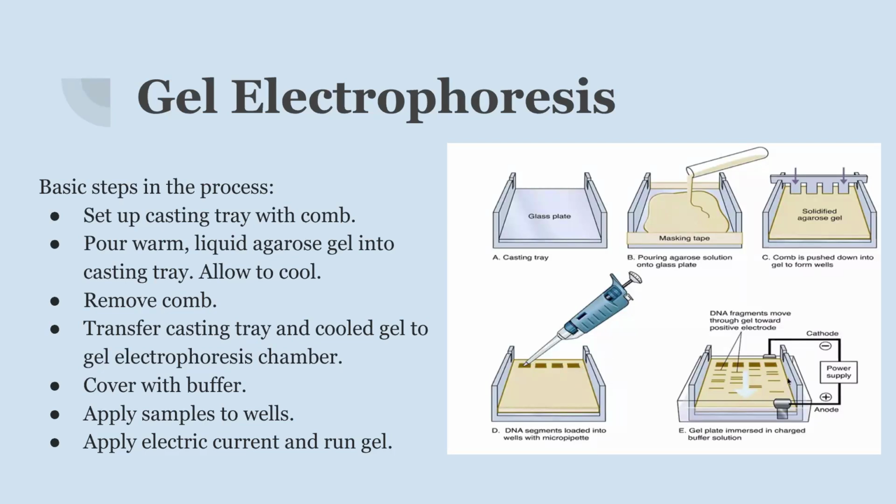And then you'd run the gel. And remember, we're running from a cathode to an anode. Cats, some people don't like them and they see them as negatives. And anodes, some people think ants are cool. So just think of it that way. So that negative end to that positive end. DNA has those phosphate groups, right? So they have that negative charge. So they're naturally more inclined to move away from that negative end towards that positive end. But larger fragments do so at a much slower pace.